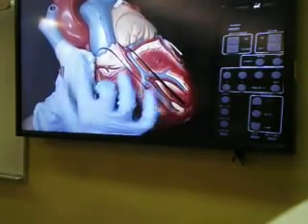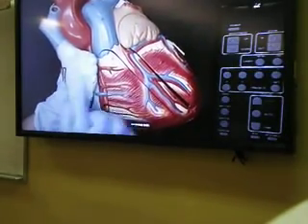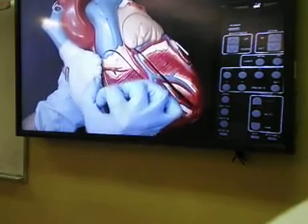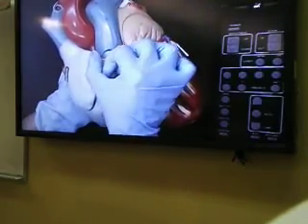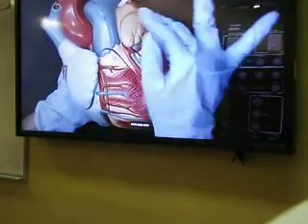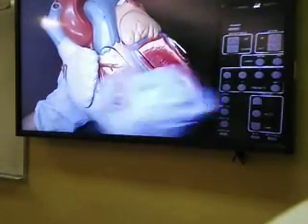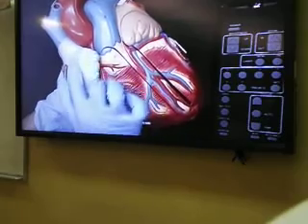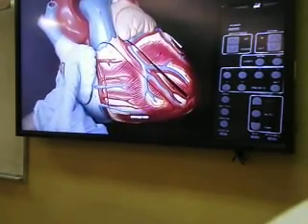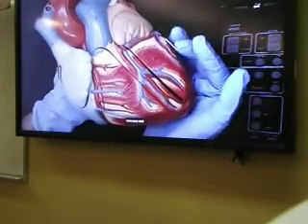Now, right over here where I am showing these two atria, I see a structure which looks like the ear of a dog, and this structure is actually covering the respective atrium. If I ask you what structure it is, this will be the right auricle, because you are looking from the anterior surface.